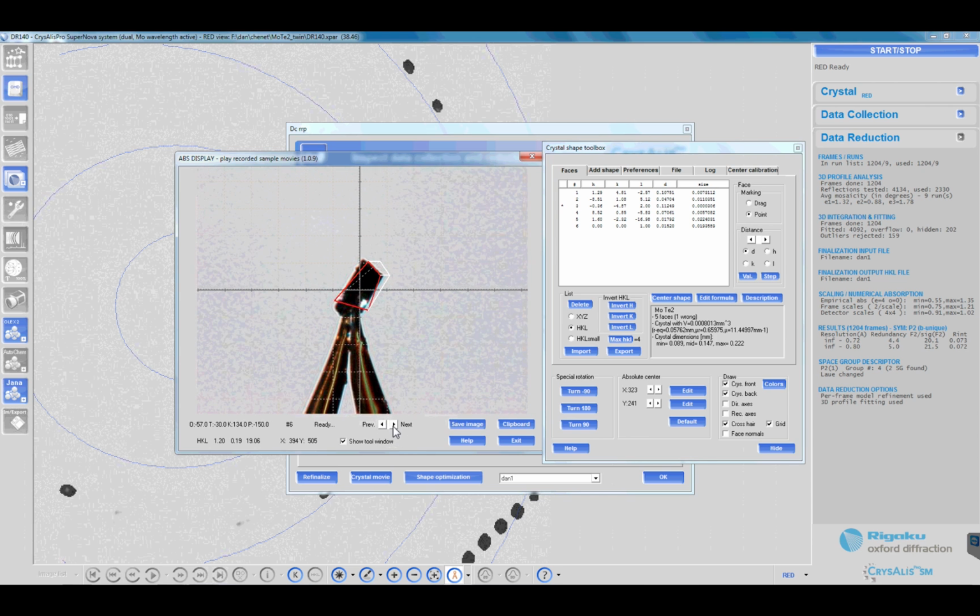the movie can be off by a hair, and it's unlikely that this is a big face with some oddball indices slightly off from 001. So we're going to leave it that way.